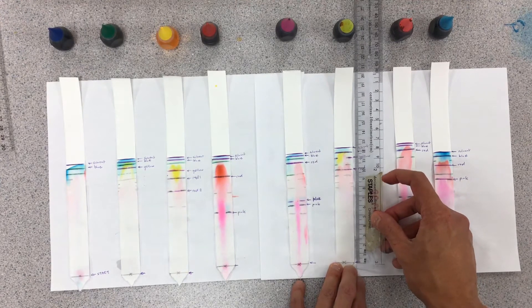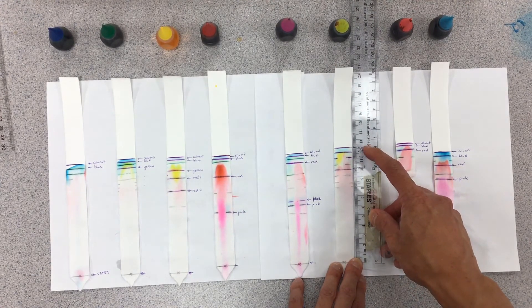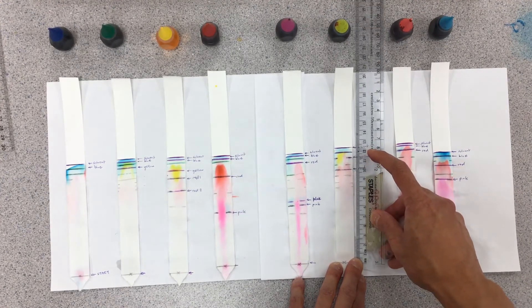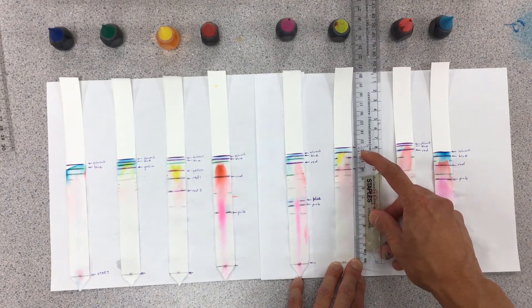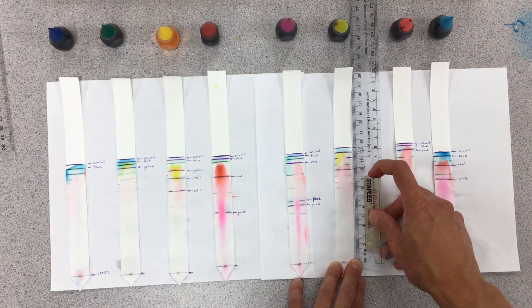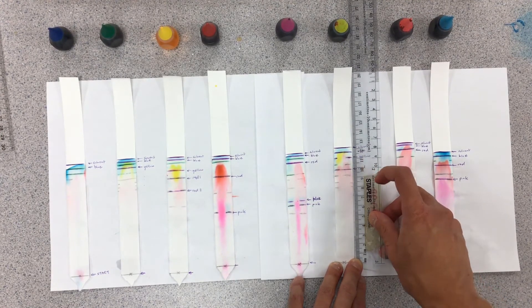Looking at this yellow neon dye, the solvent is about 12.2. The blue here is a little bit shorter. We have the yellow, that's a little bit bigger than 11, so 11.1. The red is a little bit shorter than 10, so 10.3.